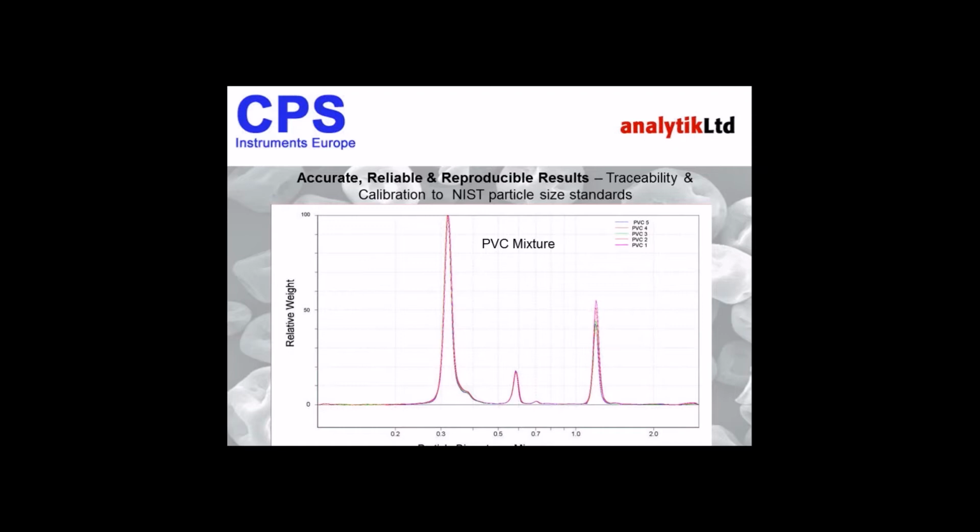However, we run the sample, we look at the results, we overlay all 5 runs, and what we end up with is, as you will agree with me, excellent reproducibility. How can that happen? Why is it so good? Simple answer. Regardless of how many variations there are, what conditions in the disk, because we are calibrating, because we're running a NIST traceable standard before our sample, this removes all of these differences. And so we always end up with real reproducible data.